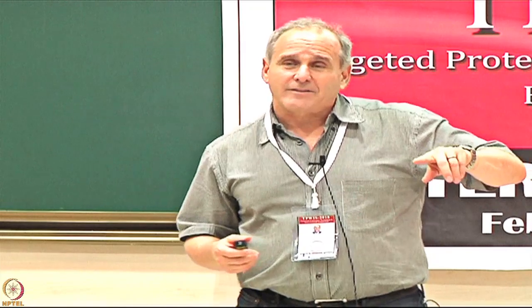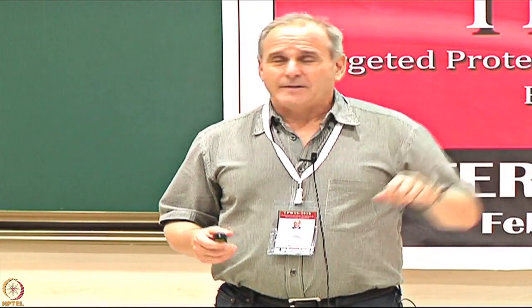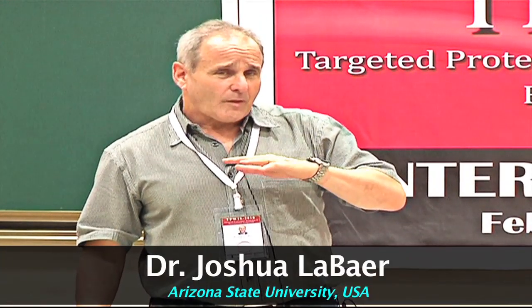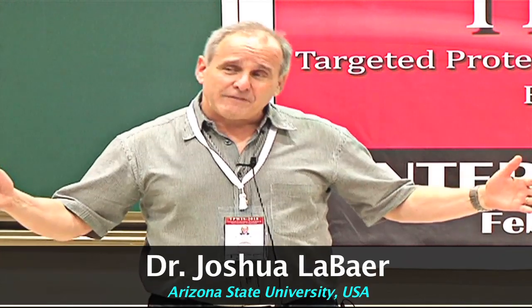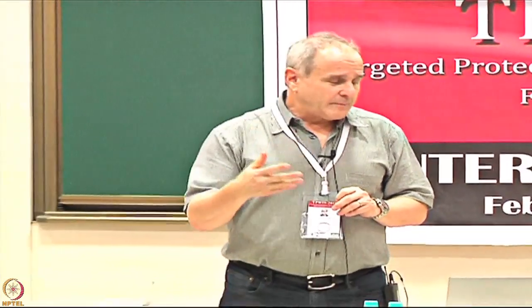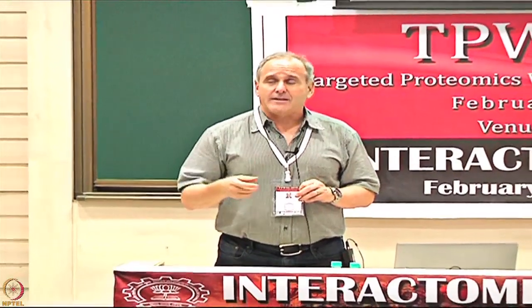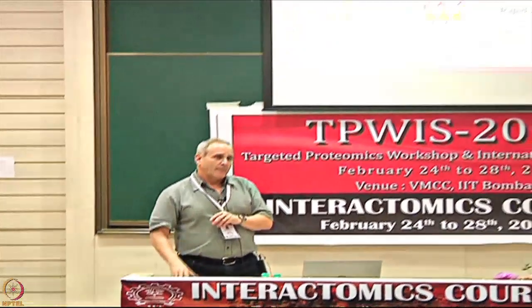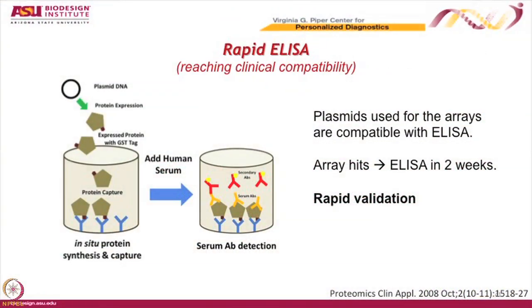Now we can come back to the ELISA assay, right? And so the ELISA assay says, okay, I can make individual proteins at a time much less costly than making 15,000 protein arrays, right? But I have to do them in a larger scale. And so one of the things that we developed in our laboratory was a way to make ELISA without having to do a whole protein purification from bacteria. Okay, and we call it rapid ELISA.